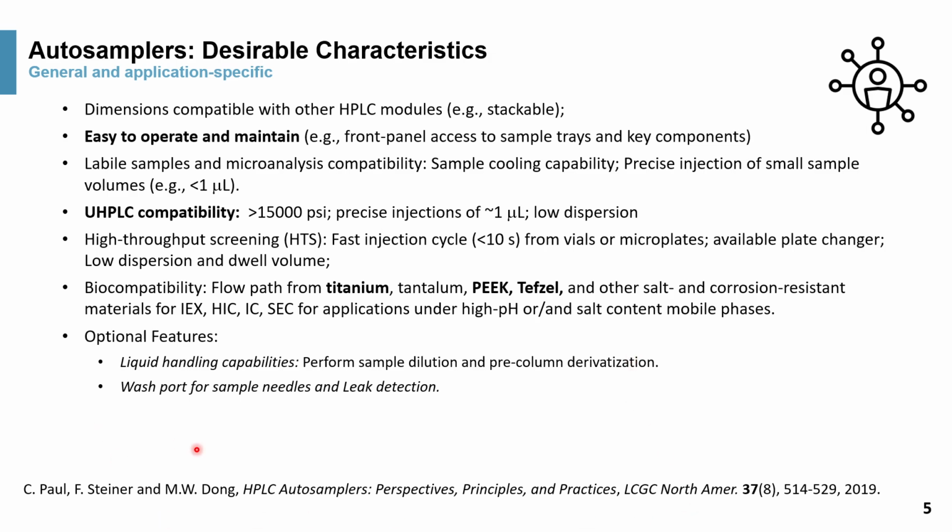I'd like to point out that in this video, most of the material came from a white paper published in 2019, where Carlston Paul is the first author, responsible for most of the figures and some of the content. Also Frank Steiner from Thermo Fisher Scientific and myself. It's titled HPLC Autosampler Perspective, Principle, and Practices. It's one paper that encompasses the insider's view of the autosampler.